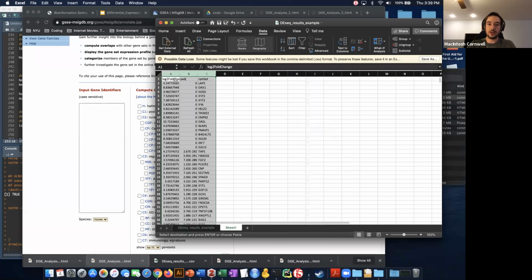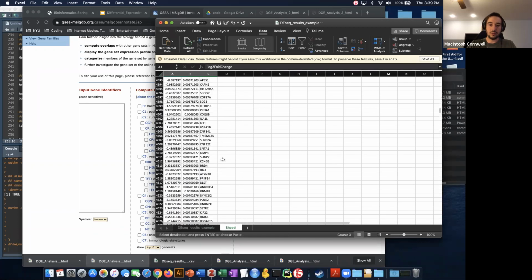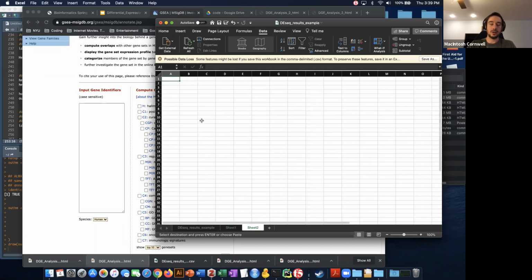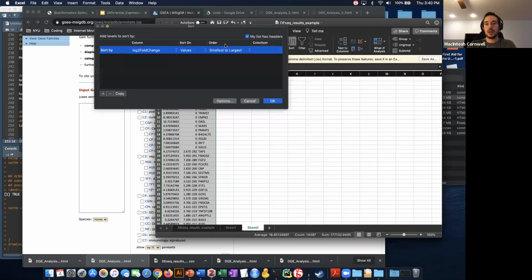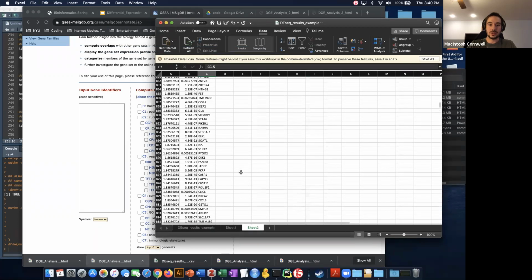I'm going to go over here. I'm going to select all the genes with an adjusted p-value of 0.01, let's say. Mind you, all this can be done in R too. I'm just showing what you can do here for speed's sake. And then I'm also going to apply a log2 fold change cutoff as well. So I'm only going to grab the genes that are also upregulated at least, let's say, 2 in this gene set.